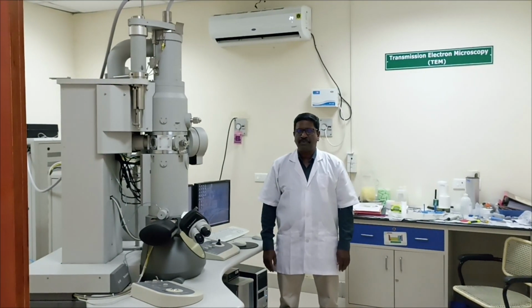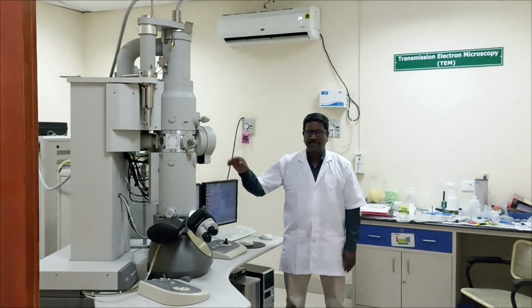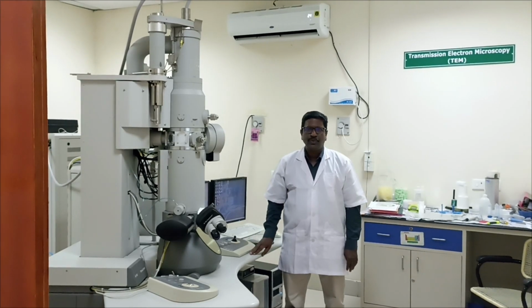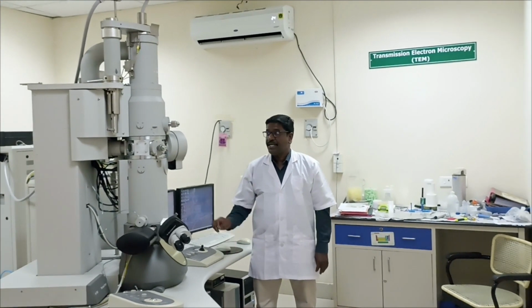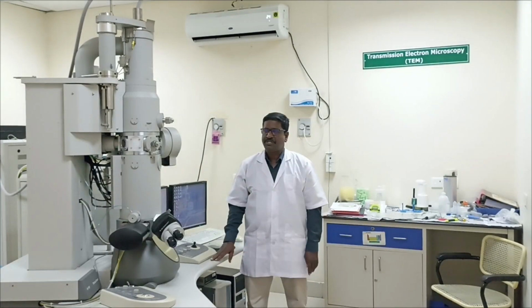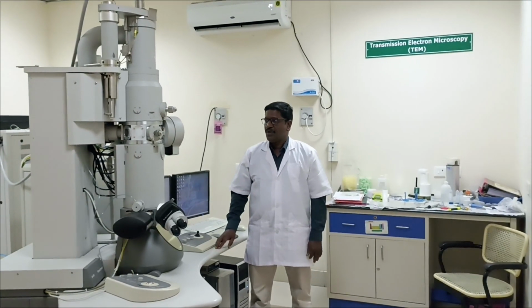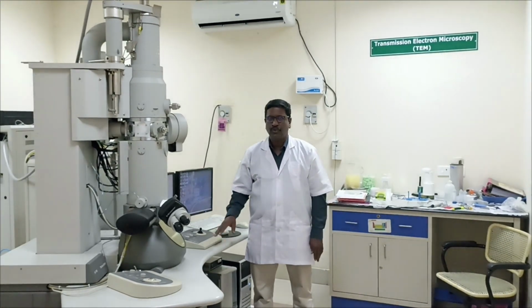Now I am going to explain about the instrumentation of transmission electron microscope. In this instrumentation, we are going to discuss what the principle is, what the different important parts of the transmission electron microscope are, and then how it works. So now let me explain the principle of transmission electron microscope.